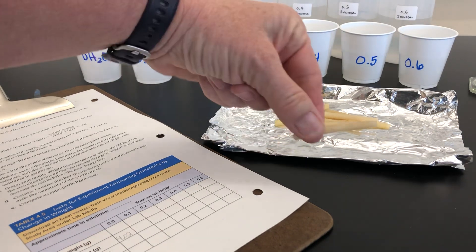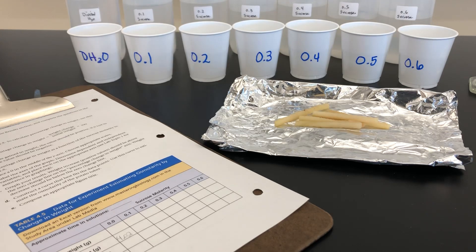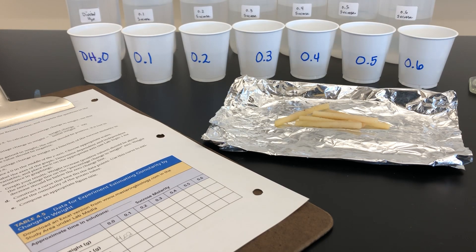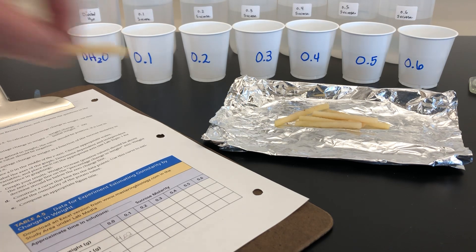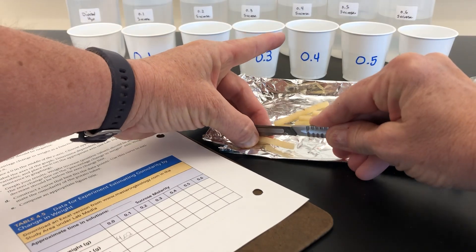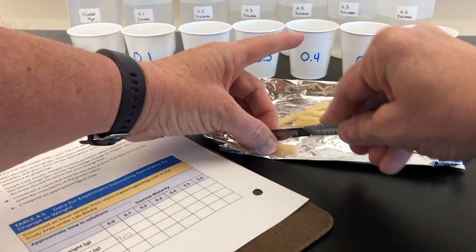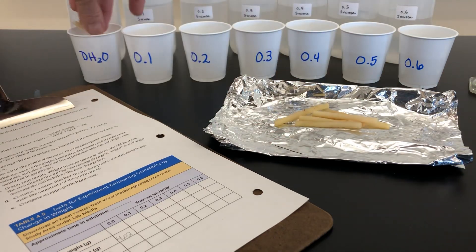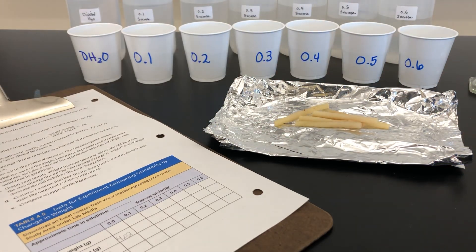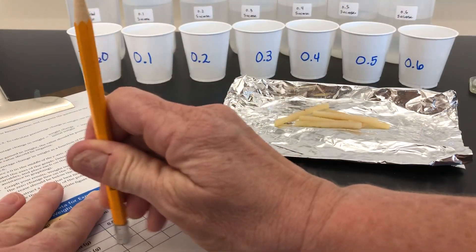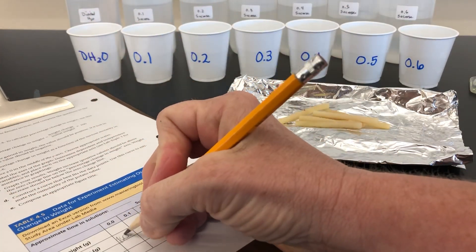The first cylinder weighs 1.01. We'll cut it in half and place both pieces into the distilled water. Make sure you've recorded this in your data table.